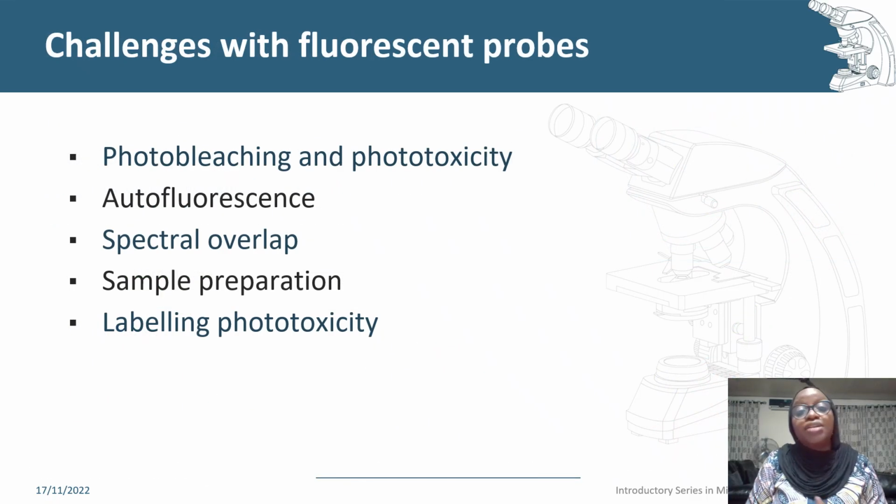Although there are several advantages of fluorescence, there are still several challenges associated with fluorescent probes. We have photobleaching, phototoxicity, autofluorescence, spectral overlap, as you've seen in previous slides, sample preparation, and lastly, labeling.